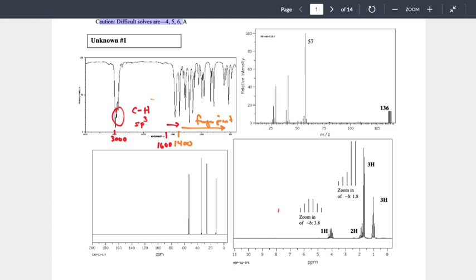Okay. Which then sets us up with the next one on the list. If we look at how I structured these individual worksheets, you might go, well, top to bottom, left to right. So top is IR, the next one to the right must be the one we're looking at. And yeah, I would argue that's a fair assumption to make. Why would I set it up that way? Same way I set it up with the worksheet. For a small amount of work, I can get a lot of information.